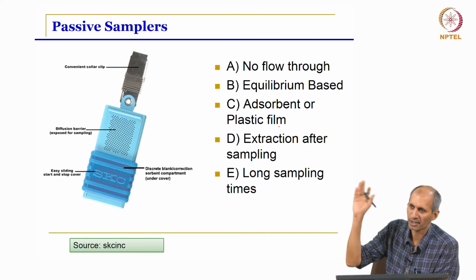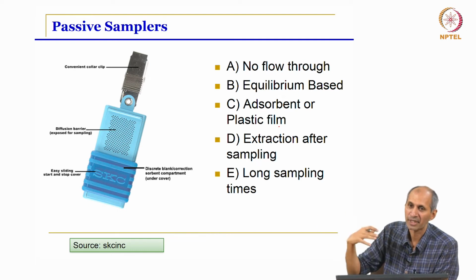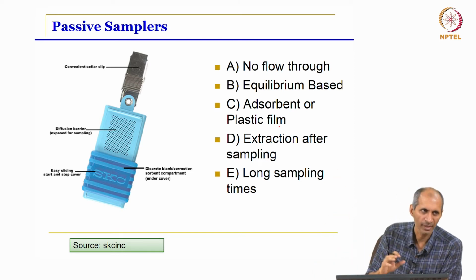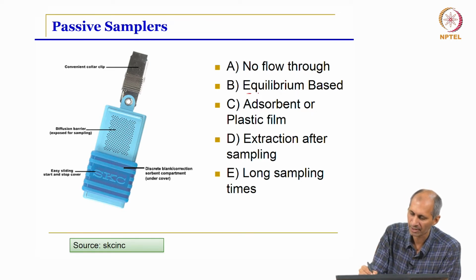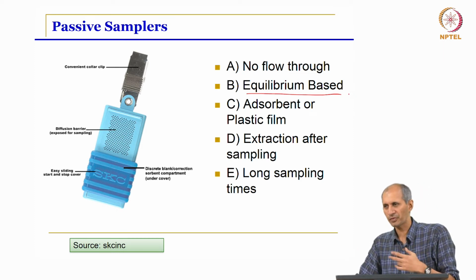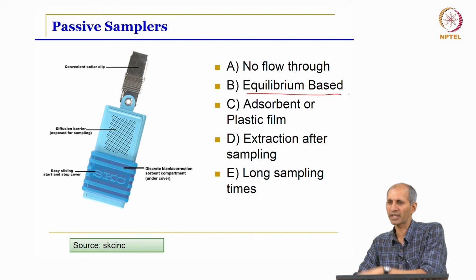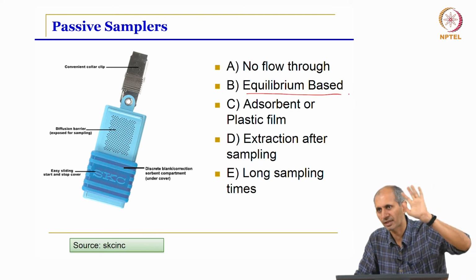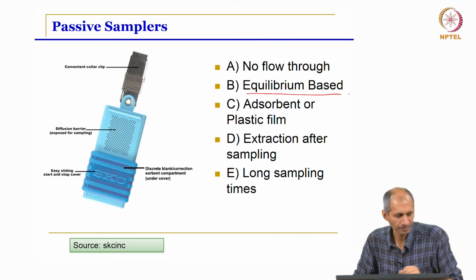You put hundreds of these passive samplers, which means it's just some matrix, some substrate, and it comes to equilibrium with the ambient air or ambient water, wherever. You put it in water, you put it in air, and this is one such thing. It's an equilibrium based method, which means at the end of some period you take it out, you assume it is in equilibrium with the ambient air, and you extract. So all the work is in a laboratory, in a processing facility, and there is nothing else in the field. You can have hundreds of these things. You bring it back to a lab and you find out the concentration.